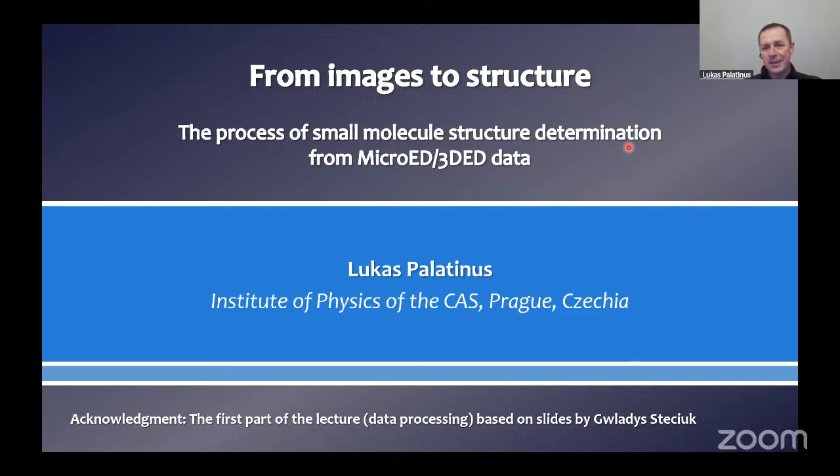Of course, in the end, it's the science that matters. So it is important that we know what we are talking about, and as long as we understand that MicroED and 3D ED are the same thing, and we understand where it comes from, it doesn't really matter that much.